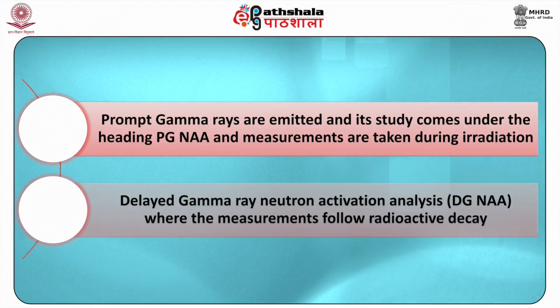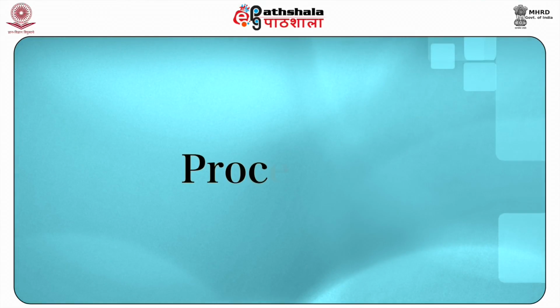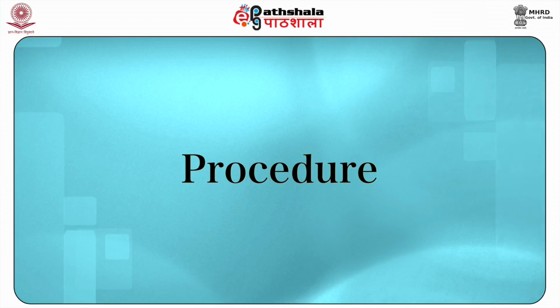About 70% of elements have properties suitable for measurements by NAA. Procedure.